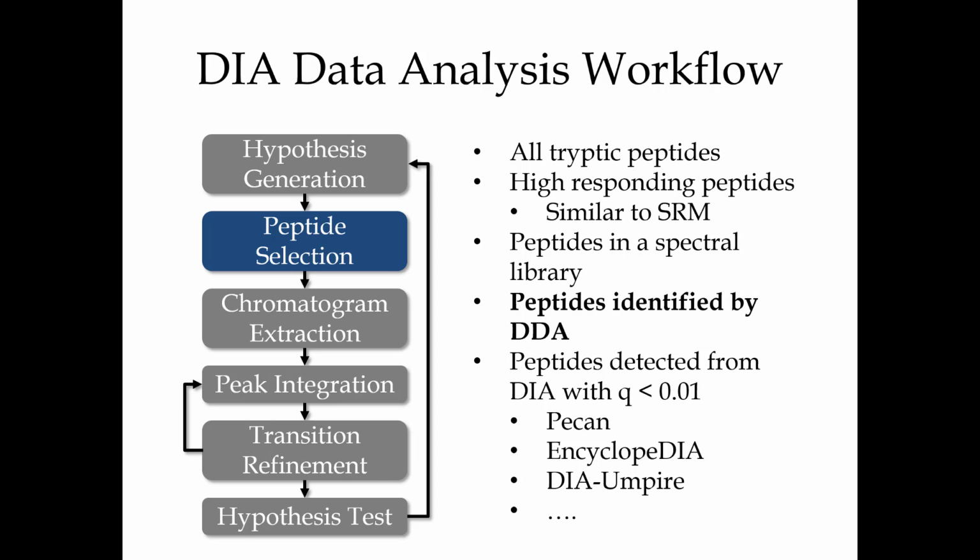Yeah, that definitely can happen. So it would be better if you actually had a spectrum and a retention time. Knowing a spectrum and a retention time, you can order synthetics to get you that, and then go back and look.